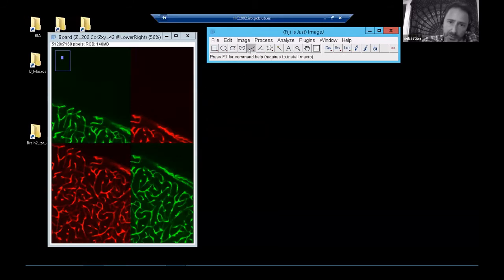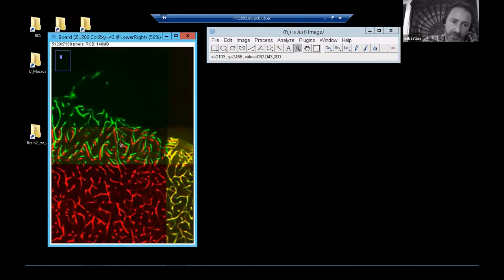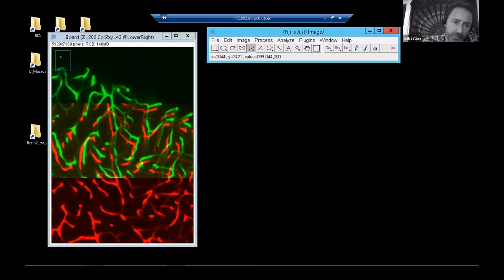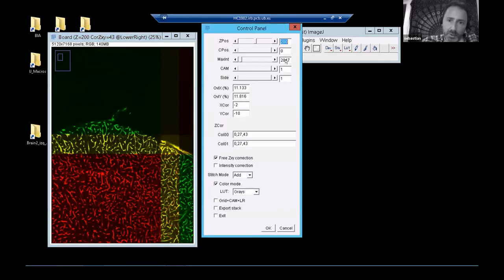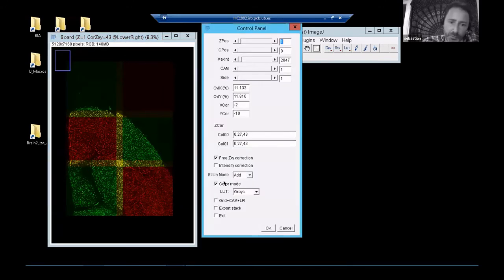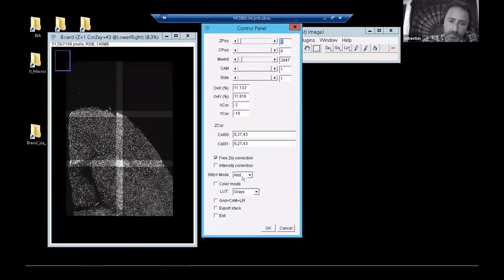The way to align the tiles is quite simple: you draw matching features. This is your first landmark and the other landmark. Press Alt and tick Register — we have estimated the X overlap between the images. Do the same for the Y overlap. You need to be relatively accurate, but you can zoom in. As you can see, it should blend to yellow if you are in a good position. You can also move in Z to check whether the alignment is good at other positions. It looks fine.